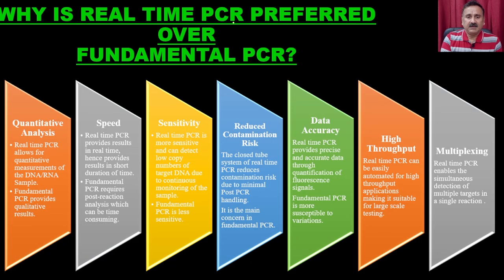Now the question is, what is the advantage of using real-time PCR? Why is real-time PCR preferred over the fundamental PCR? The first advantage is quantitative analysis, which means real-time PCR allows for the quantitative measurement of the DNA or the RNA present in the sample, and it provides quantitative results.